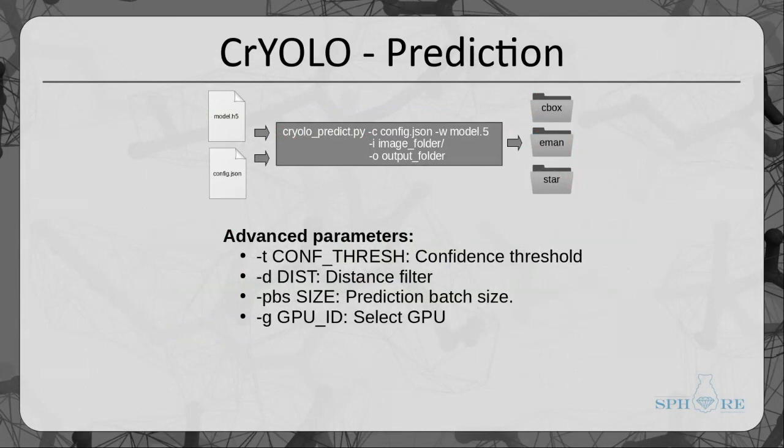So the nice thing is that the prediction is pretty fast, 6 micrographs per second, as I already told you. And this makes it possible to apply the prediction command also without a GPU. So if you run crYOLO on a CPU to predict or to pick your data, it will roughly pick with 1 second per micrograph, at least on our machines. We have some, let's say, low-budget workshop laptops, and on these machines it takes 5 seconds per micrograph on a common CPU.